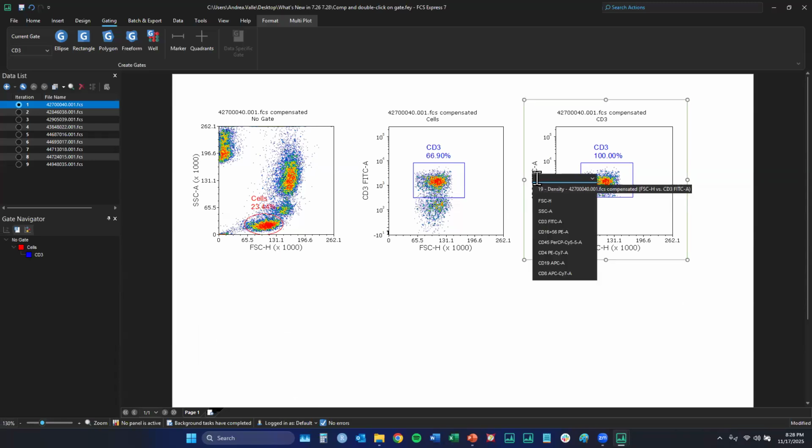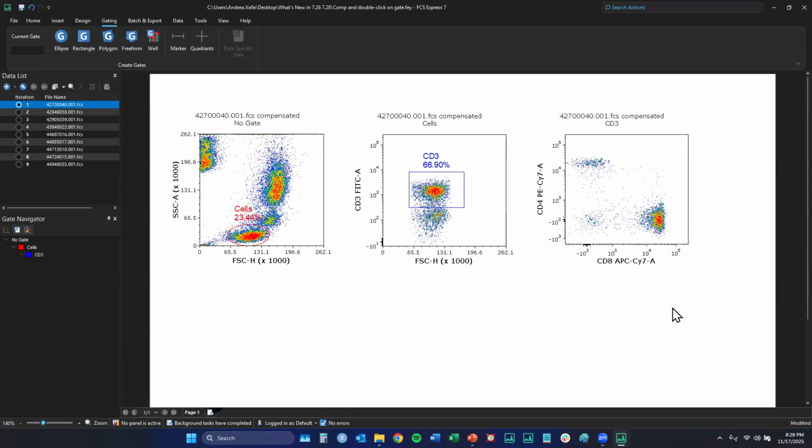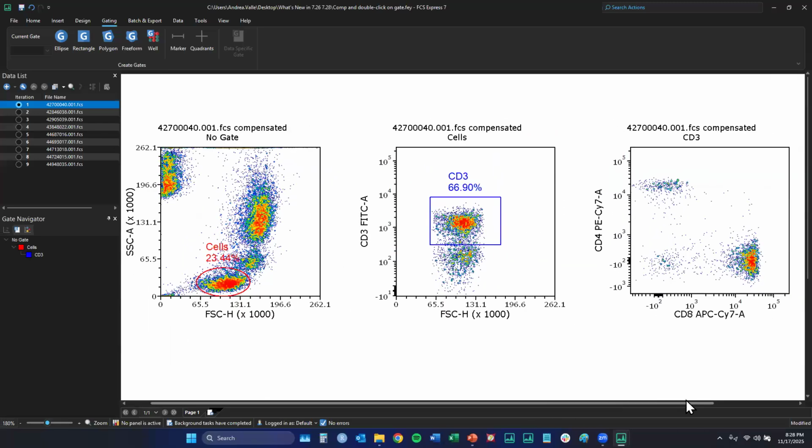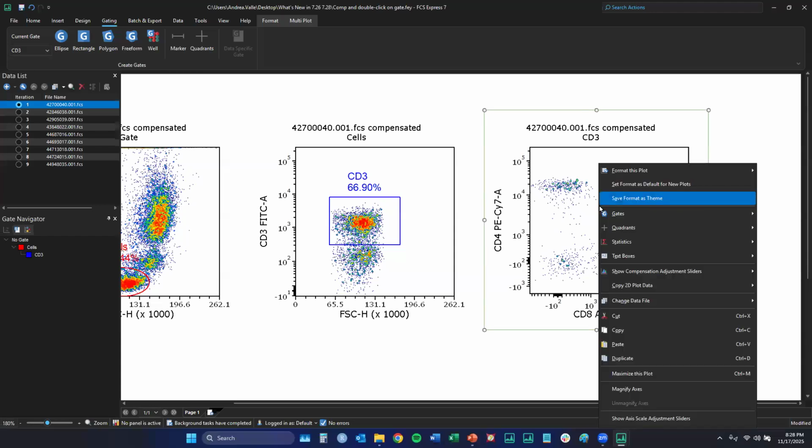Another thing that I want to show you, now that we have a few plots here, is let me open a bunch of parameters. Okay, we can use this plot. A couple of versions ago, we introduced sliders to change the axis scale. If you didn't see this feature, then it might be a good opportunity for me to refresh.